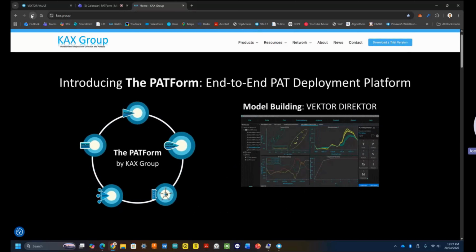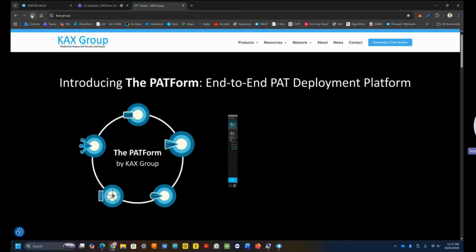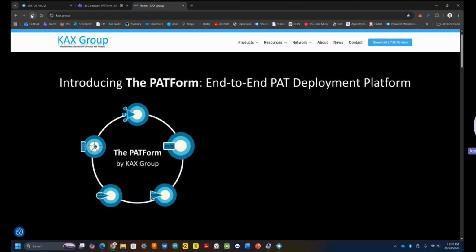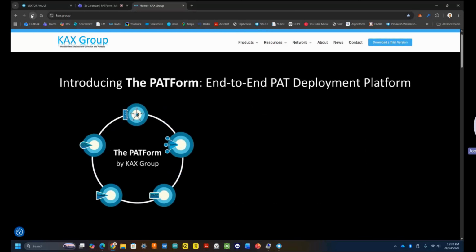So we've organized this webinar to show you how it all fits, from data acquisition through to modeling, all of your regulatory requirements and approval steps for all your assets in Vault, and then moving on to ProAccess where you would deploy in a GMP mode. So this will take a little bit of time. There are a lot of moving pieces.